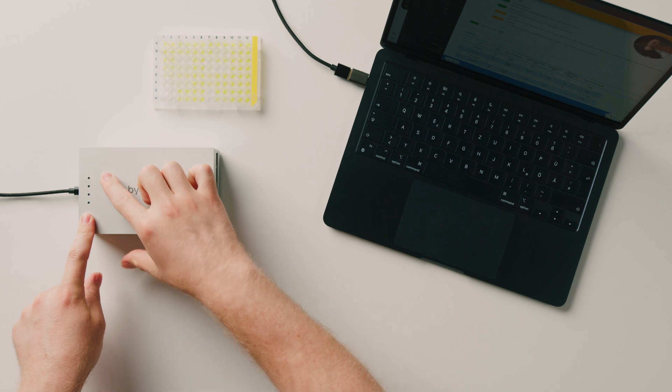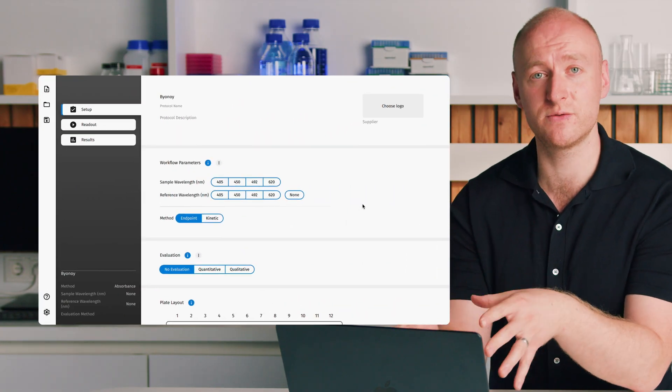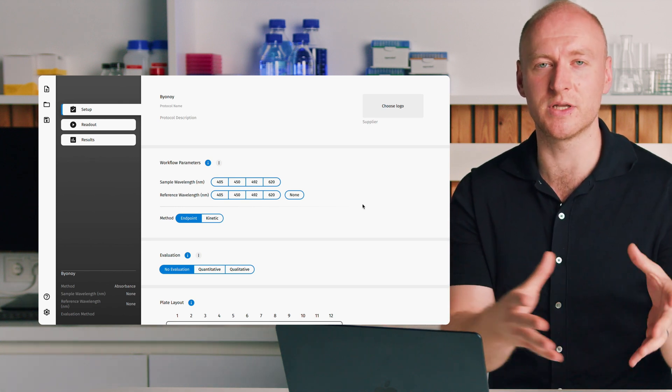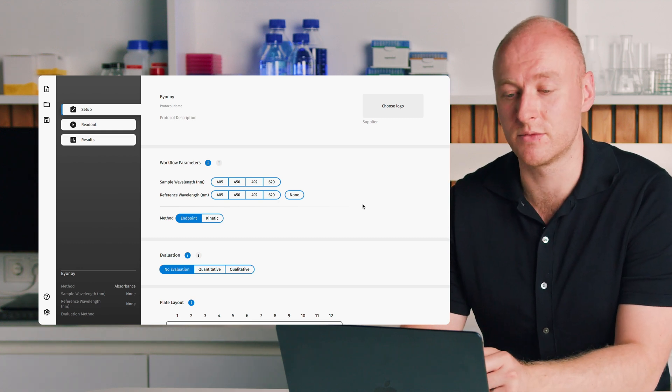We can go ahead and attach the instrument. When we plug it in, you'll see all of the LEDs light up in sequence. It's important that you see this when you attach the device — it shows a successful connection to the software and confirms that the self-test performed on plug-in was also successful. Switching over to the software, we really tried to take the concept of the device — small, minimalist, reductive — and apply that to the software to provide a nice user interface.